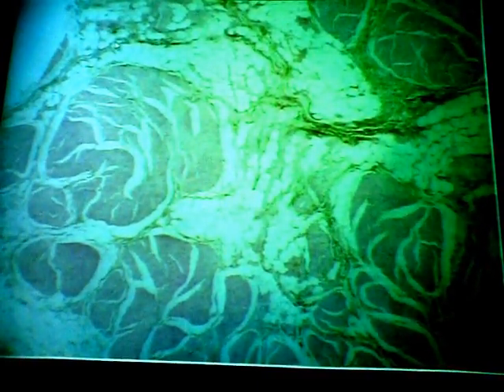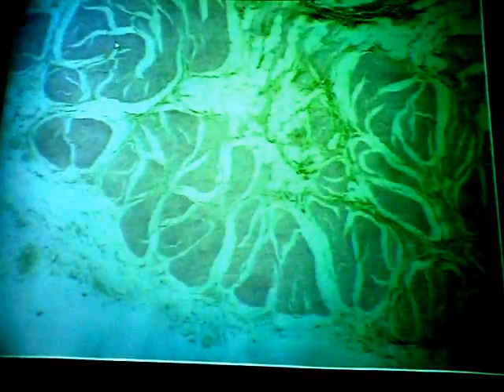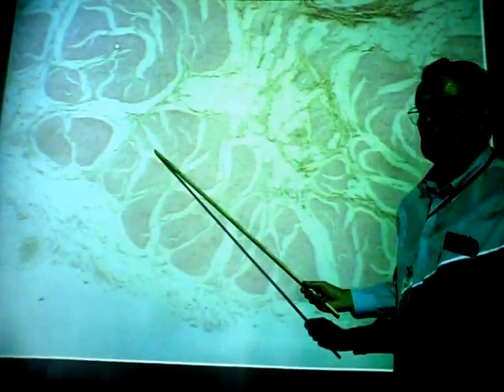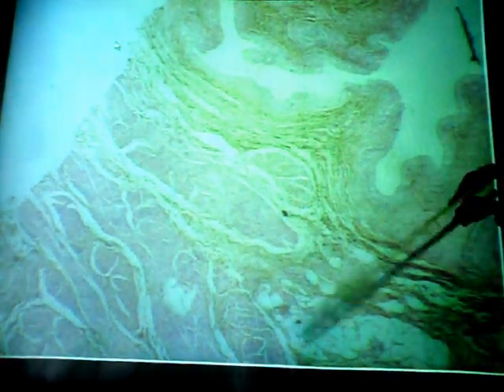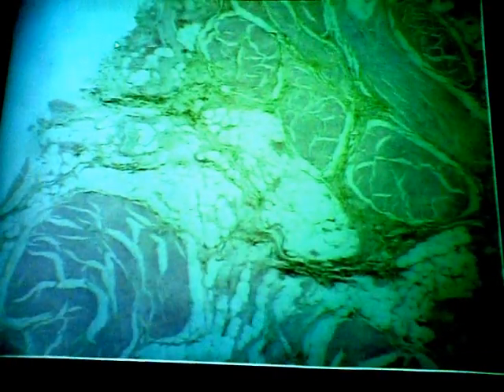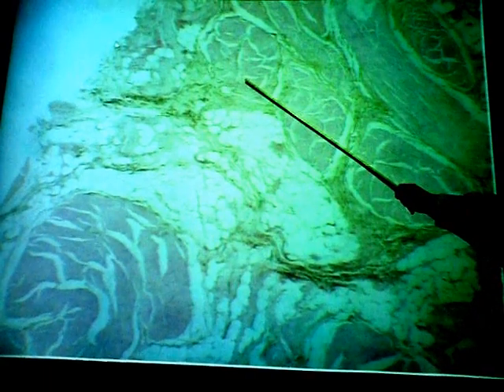Now, it's hard to tell them apart, I think you'd agree. If you're out on the edge of the organ, and you can see the adventitia beneath it, on one edge, that'd be longitudinal smooth muscle. If you're up at the other end or interior of the wall, up here, your adjacent lamina propria, again, that's longitudinal smooth muscle. And it's in the middle where you've got muscle on both sides, like we have in here with muscle here and muscle there, that'd be your circular layer of smooth muscle.